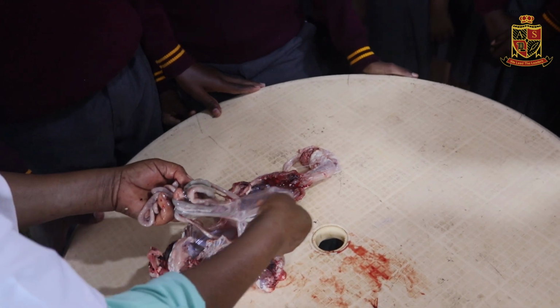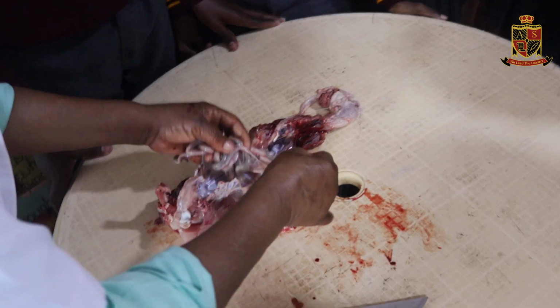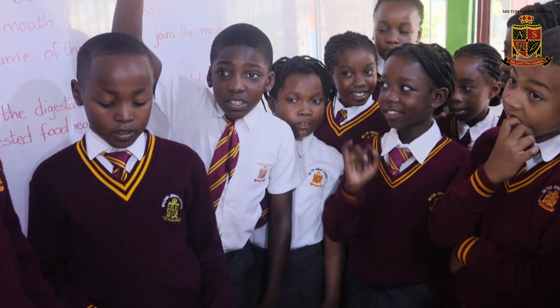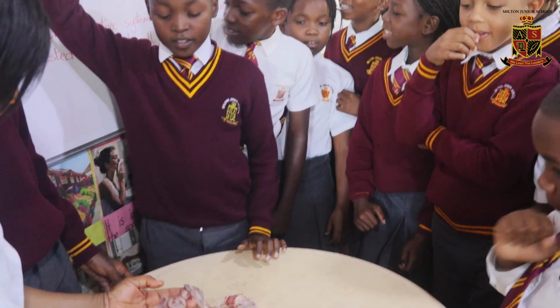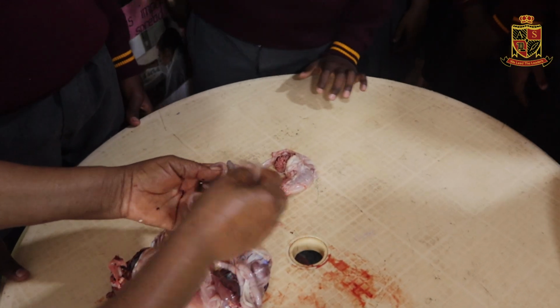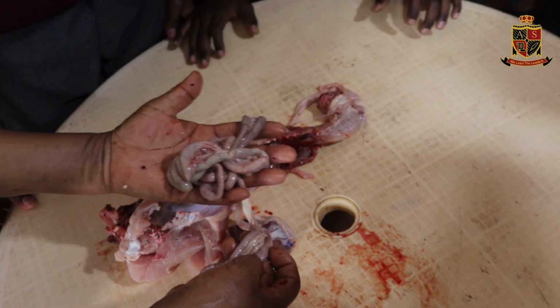So these are the large intestine. What is stored in the large intestine? Yes, Pedro. Waste. These are the small intestine. You can see the difference, isn't it? Yes, these are the large intestine. These are the small intestine.